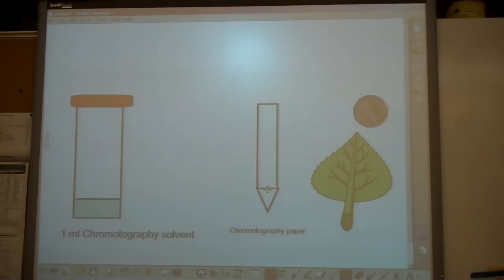Then you take your chromatography paper right here. You have your students cut a little triangle at the end and measure a line up. I believe they say one centimeter from the end. So they draw their line here, they cut so we have a point.